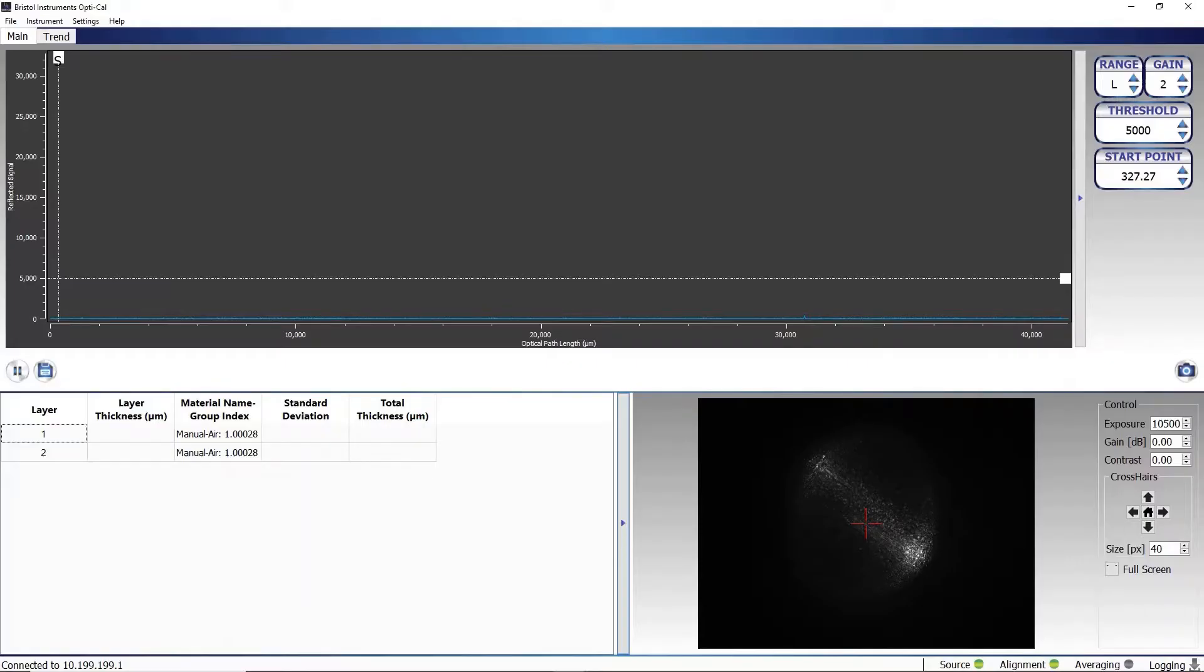The Bristol OptiCal software can display the measured thickness for up to 31 layers of material.